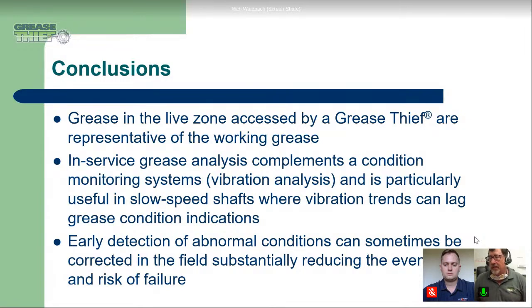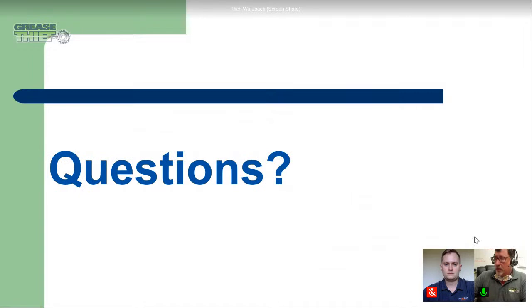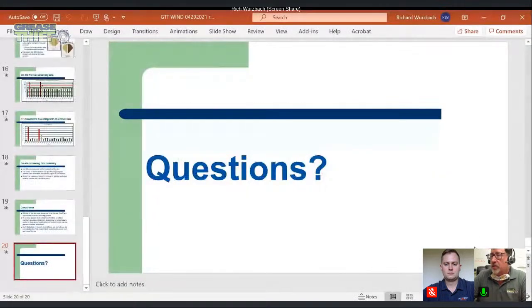And then getting the early conditions in the field, and maybe being there and doing some things in real time before we walk away and wait weeks for samples to come back. And I think that's really the power of the mini lab. So at this point, I want to kind of pivot. It's asking for questions, but I'm going to drop out of this shared screen, and I've got a kit right here in front of me, and I'm going to turn the camera around.